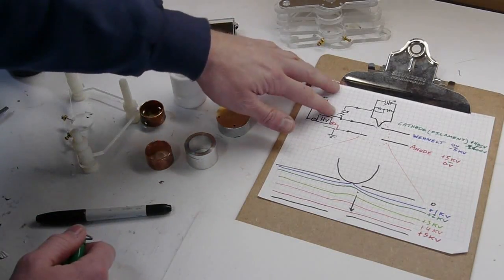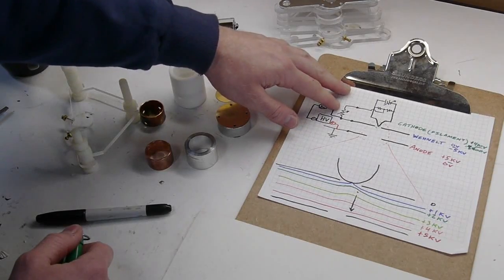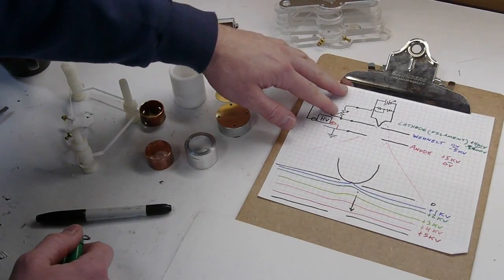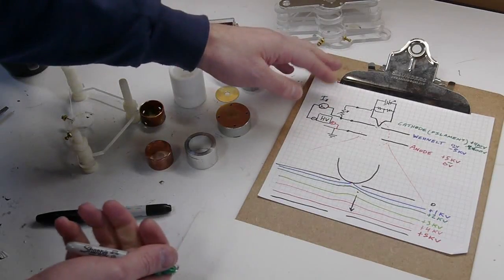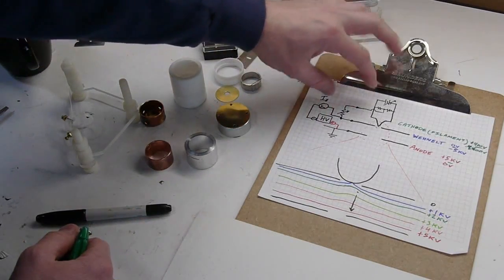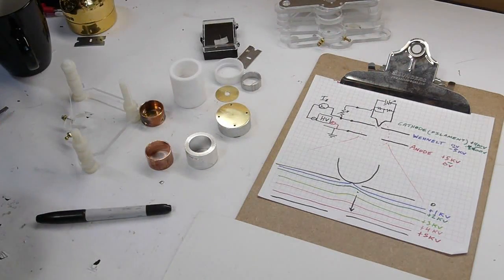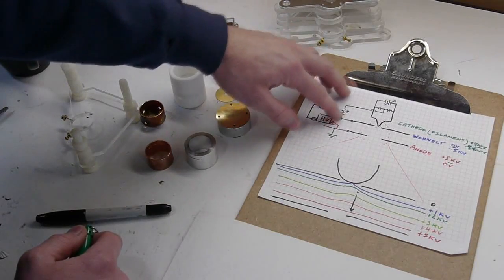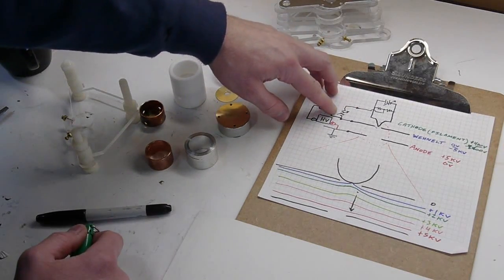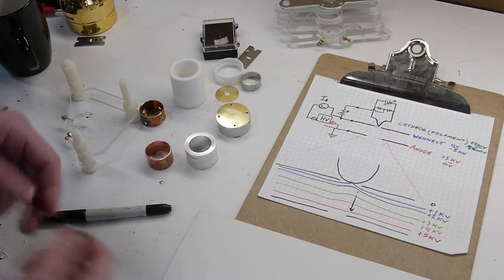And this variable resistor controls how positive it's going to get. So if this resistor is a very high value, like let's say 10 megaohms, any current flowing through here will cause a large potential difference. So as this filament is boiling off electrons at some current level, let's just say 100 microamps, the 100 microamps flowing through this variable resistor will determine what voltage the cathode ends up being.